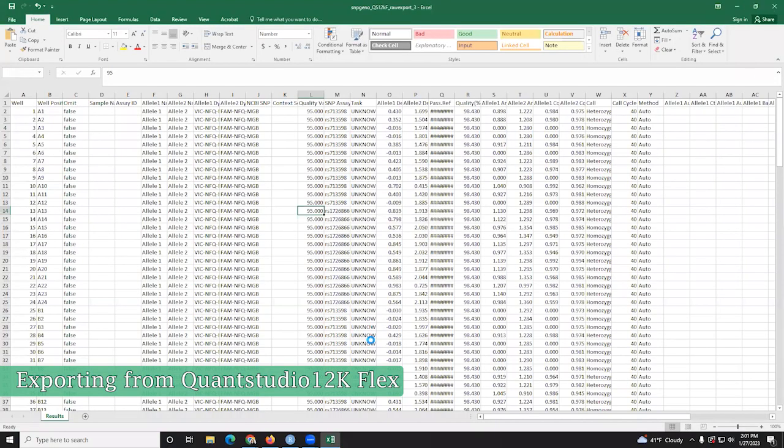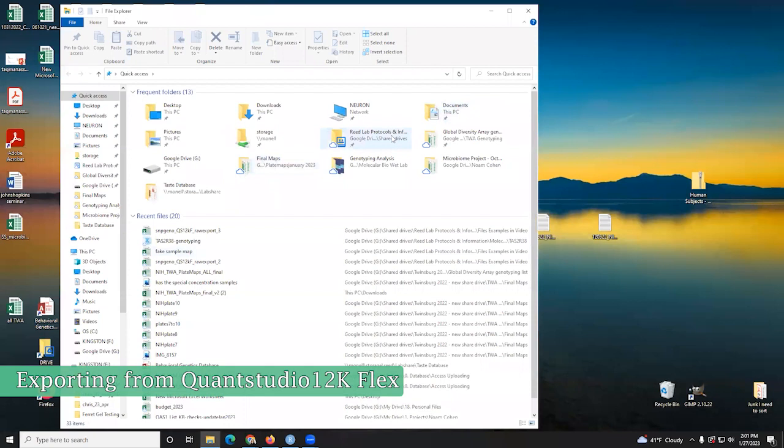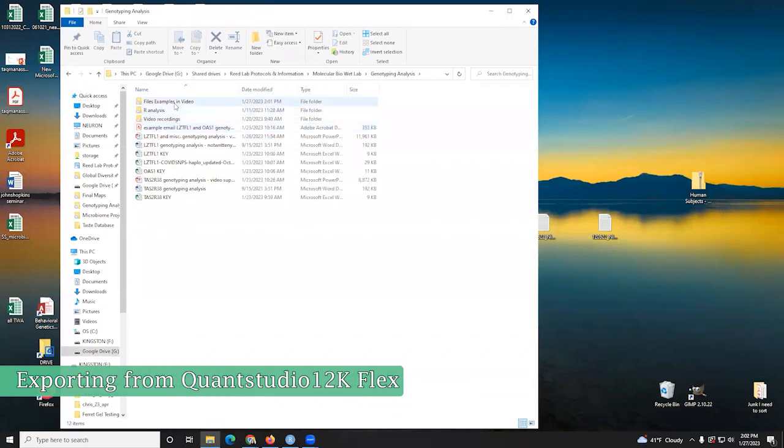Then I'm going to open a file. That was the wrong one. I had that open earlier. I'm going in. I'm going to go find the file I just downloaded. And there she is.